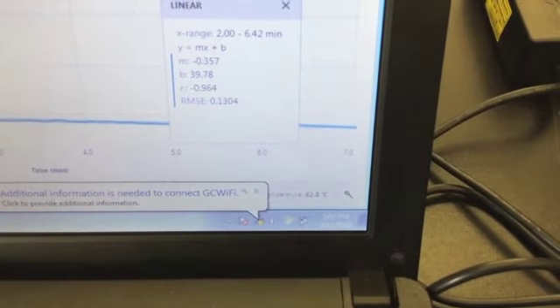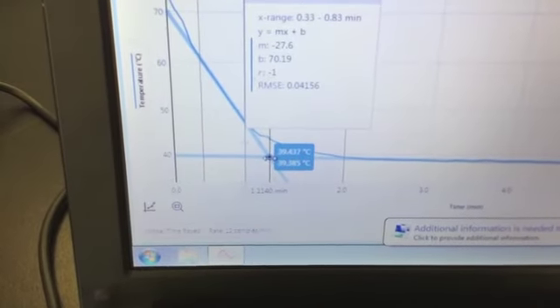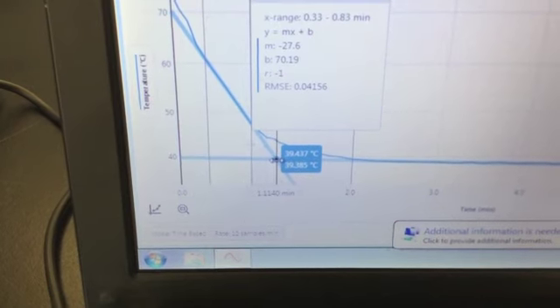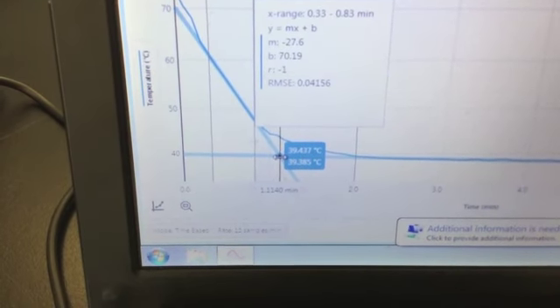Also, because we are going to be using the freezing point depression factor of 3.9, we'll only have 2 significant digits anyway. So this is close enough for us to use for our data calculations.